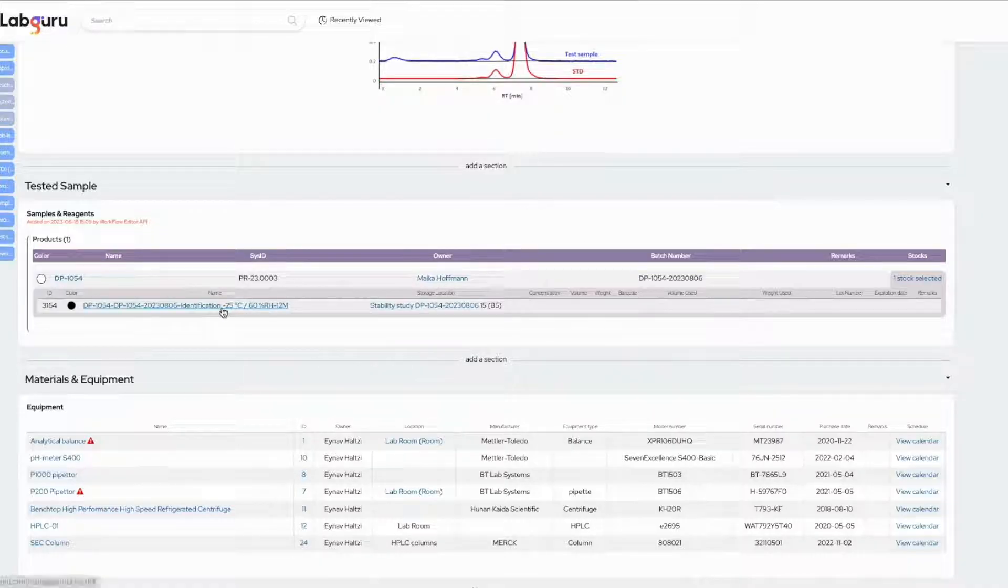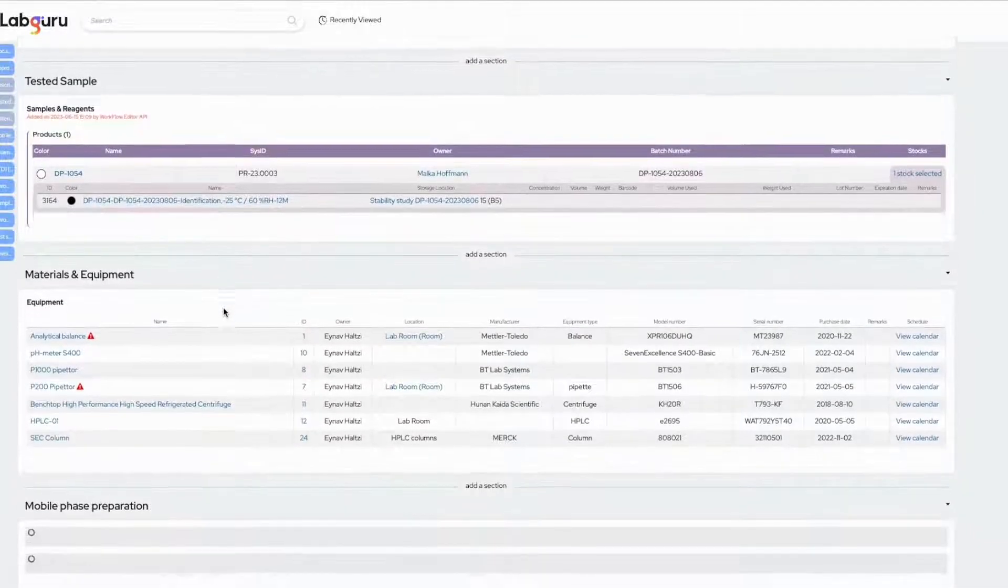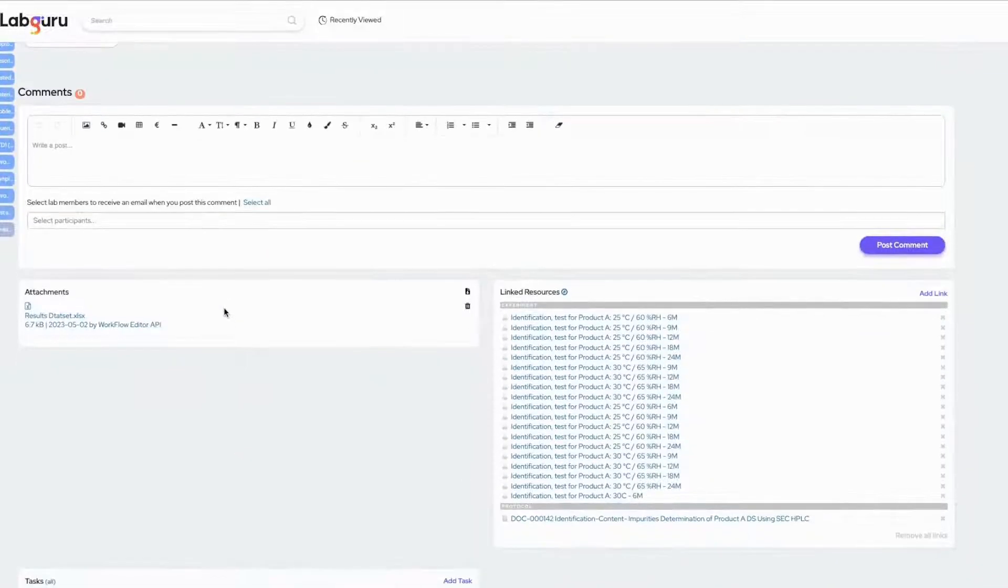In addition, a stock designated for each test was automatically created and added to the stability experiment.